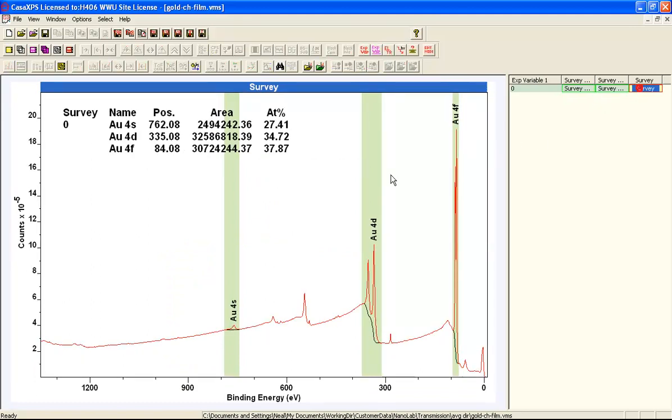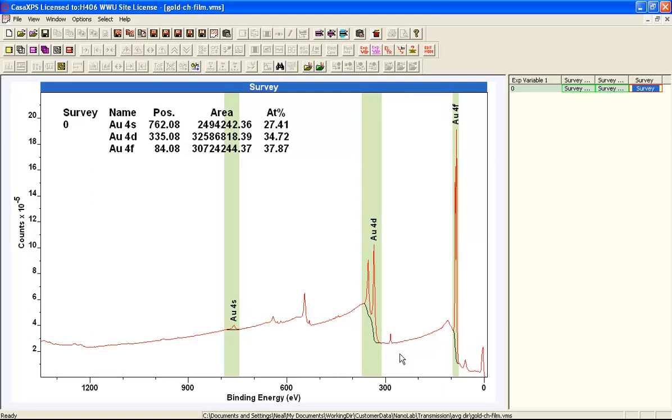So the question is, if you have a contamination, can you use any one of these peaks to quantify for gold? If you do not know the extent of this contamination, then clearly you have to be very careful about the amount of gold if you measure it with the 4S versus the 4F.